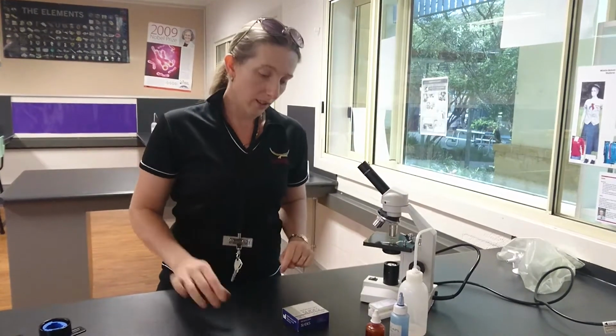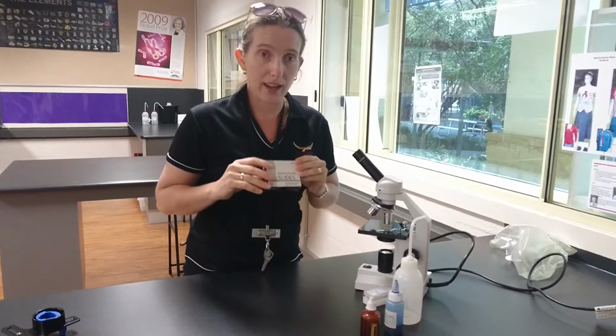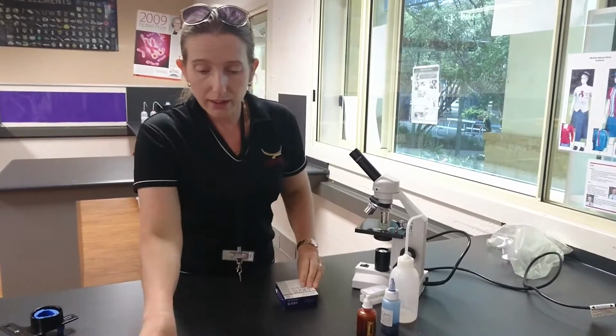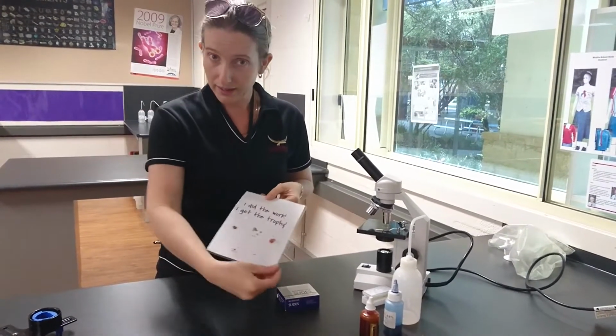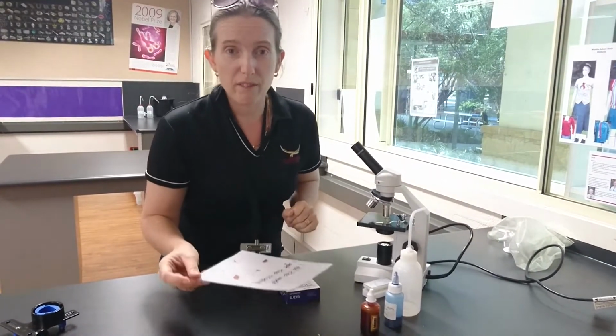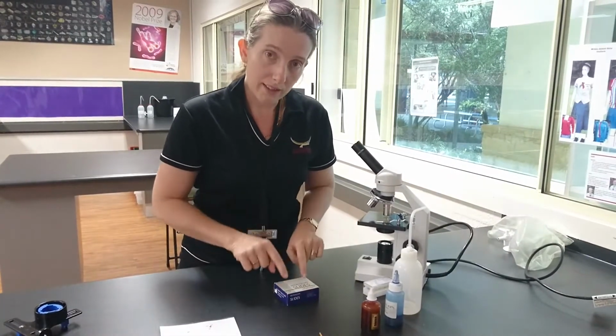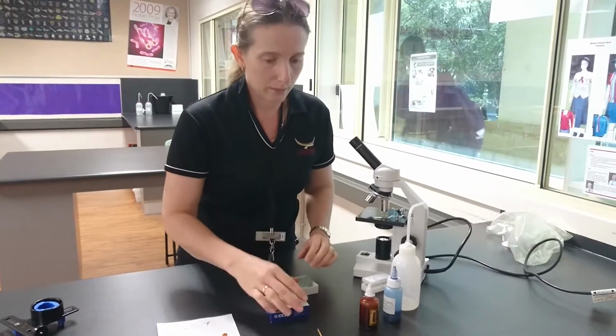Okay, this video is on how to make a microscope slide so that you can look at all of the perpetrators and suspect samples. Now you're going to be getting a note like this that was left by the perpetrator with food all over it, very messy eaters. And you have to take samples of that food and make a slide of them to put under the microscope.